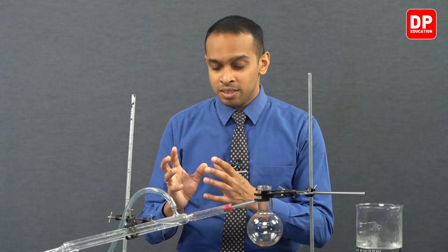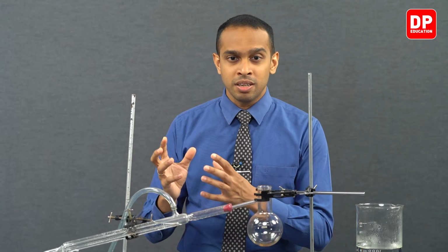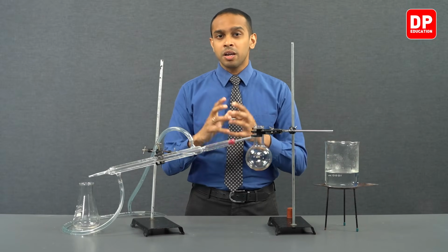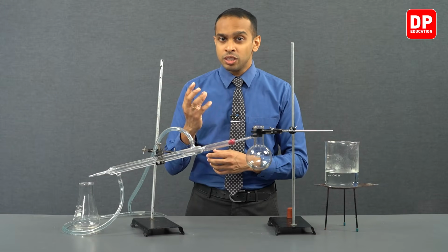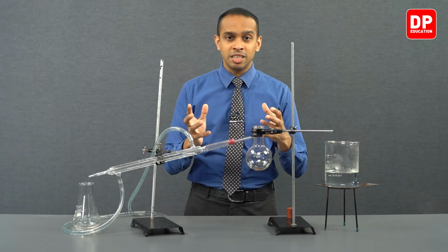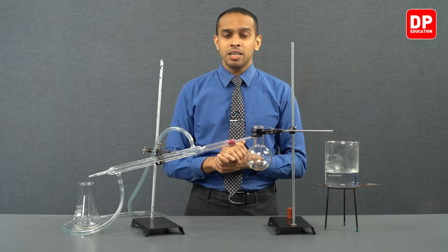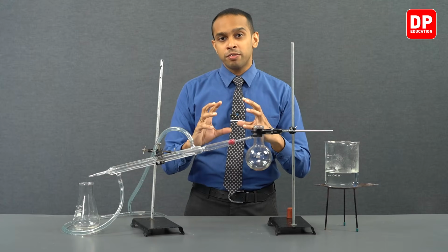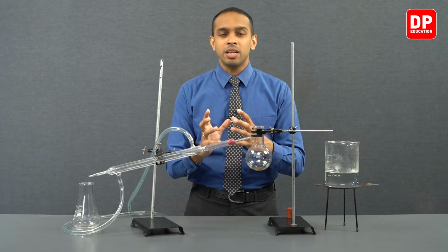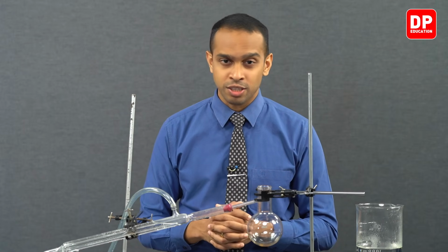However, when a separate solvent, which is diethyl ether, was added to this aqueous mixture, we saw the cloudy nature of the aqueous mixture disappeared. The cloudy nature of the aqueous mixture was present due to the essential oil being mixed in the aqueous medium, and since they were not very miscible with one another, you could observe that cloudy nature. When we added diethyl ether, majority of the essential oil got dissolved in the diethyl ether layer, and the water layer started clearing out. And this is referred to as the solvent extraction method.